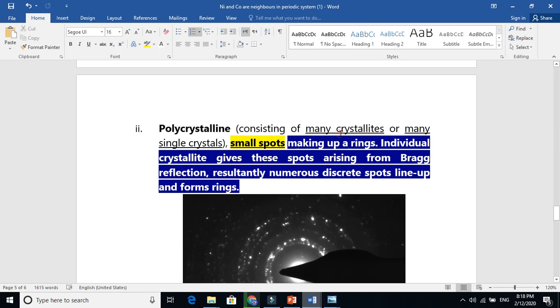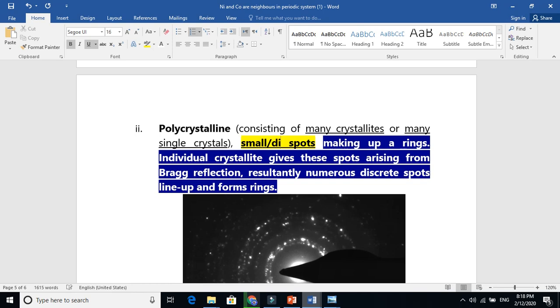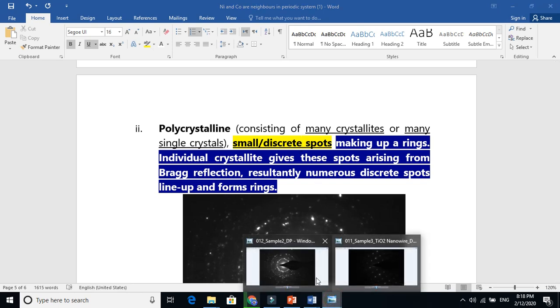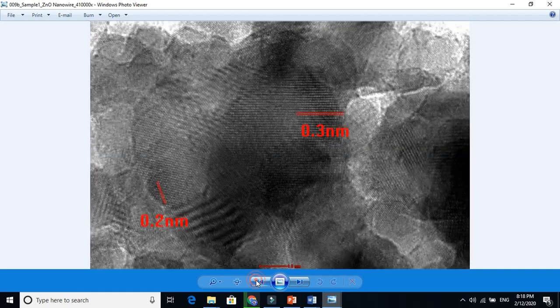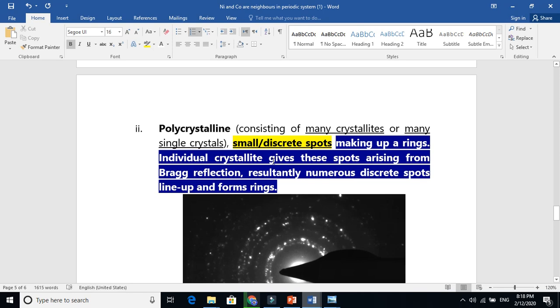Polycrystalline consists of many crystallites or many single crystals. The small discrete spots make up a ring, because each discrete spot comes from an individual single crystal. From every single crystal there is one reflection — like reflections from individual mirrors. Individual crystallites give these spots arising from Bragg's reflection. Resultantly, numerous discrete spots line up to form rings.